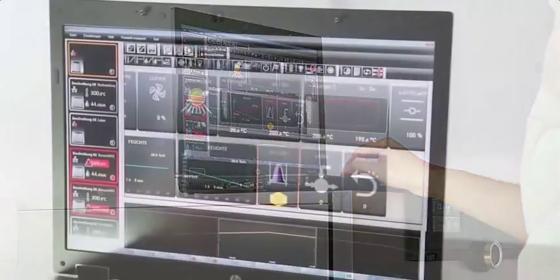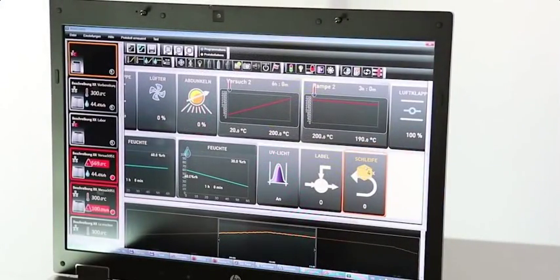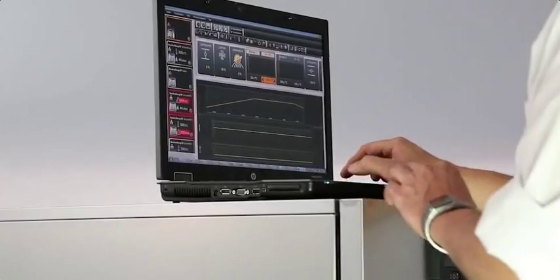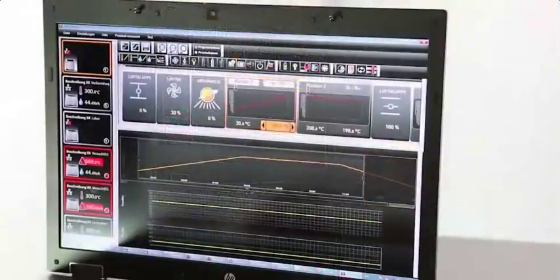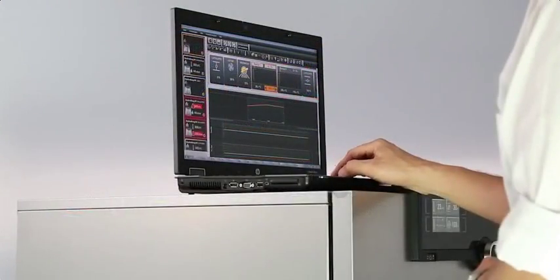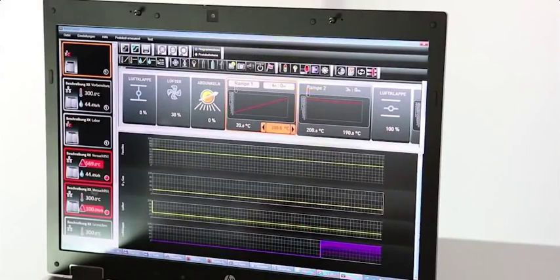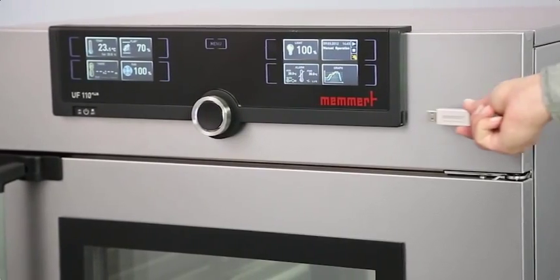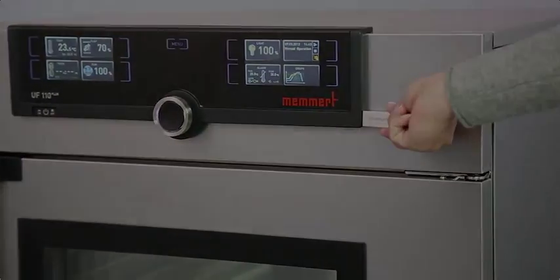Repeat functions can be inserted at any place within the program sequence. Atmo Control shows the process sequence graphically while you are programming, giving you a clear overview. When your profile is completely programmed, simply upload it via USB stick or ethernet connection.